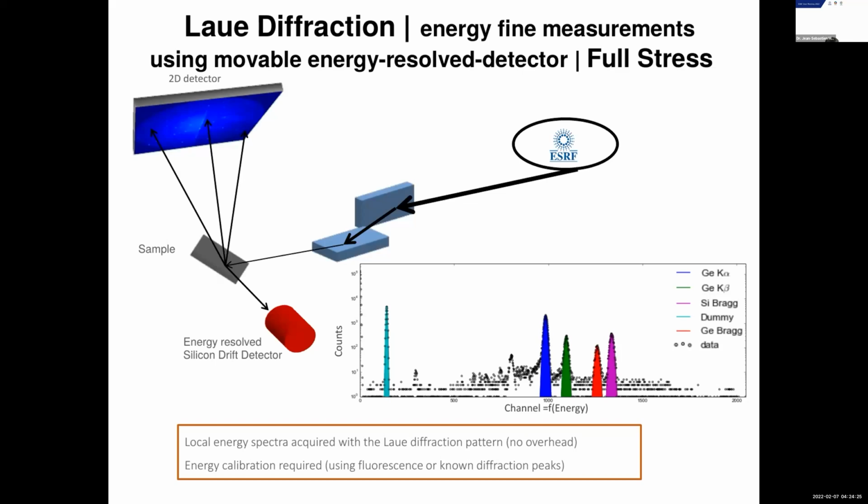Except for carbon, I think we can measure titanium. Except for diamond, because diamond is so well crystallized, I would say the lowest Z material has been titanium, could be. But we have also recently used a beryllium furnace which has a beryllium window, and we have seen the Laue pattern from the beryllium window.